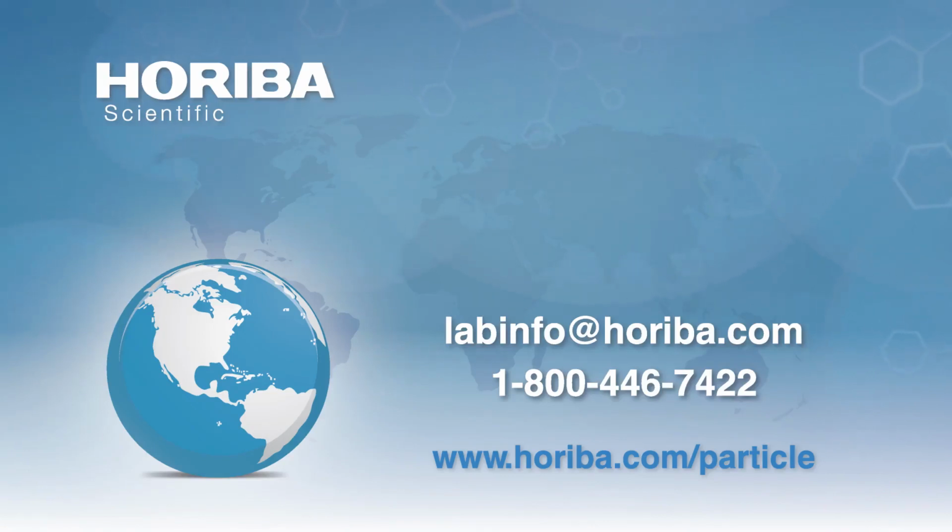The other question is, can using a fluorescence tag that is efficient possibly look at smaller biologicals? That's another area that we're actively working on now. And again, things just kind of got messed up with lab shutdowns. We don't have access to a BSL-2 facility with live viruses, which is where we want to chase that. But yeah, we have some strategies for that, and that needs some testing before we can say exactly which ones work the best. Perfect, thank you.